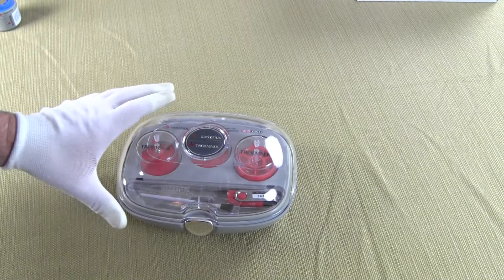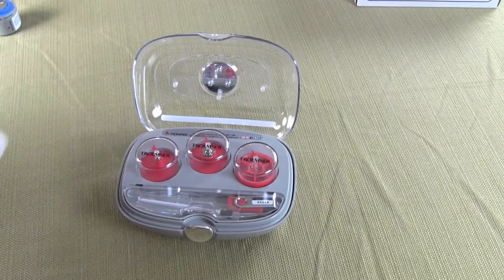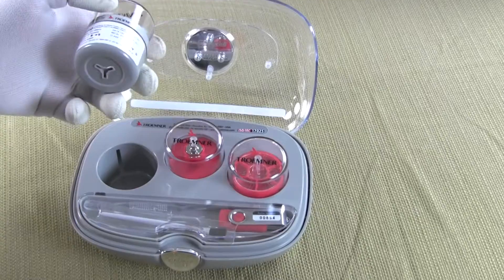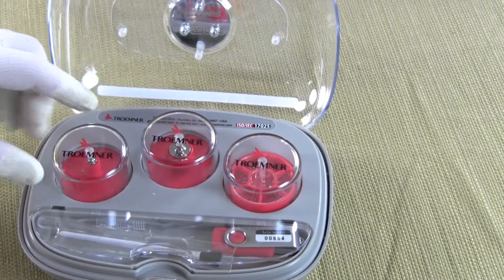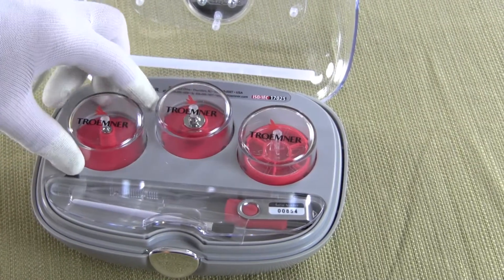Welcome to Precision Weighing Balances. Today we'd like to show you the CALPATS that we offer. These CALPATS consist of three weights. This particular CALPAT has a 2 gram, 20 gram, and a 20 milligram weight.